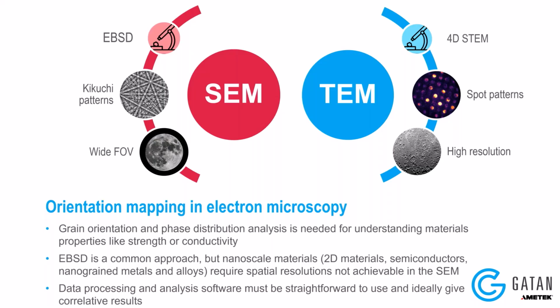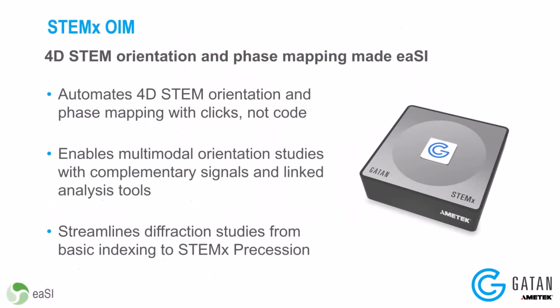And so when we do orientation mapping, we want to have data processing techniques that are straightforward, easy to use, and you can also correlate with other data techniques such as elemental analysis, which we'll talk about a little bit in this presentation.